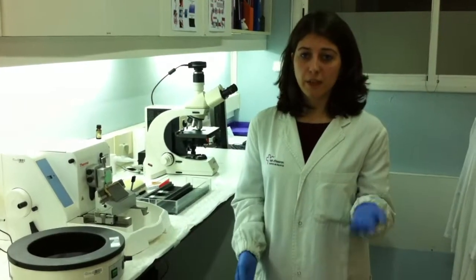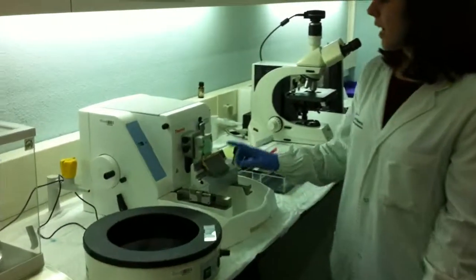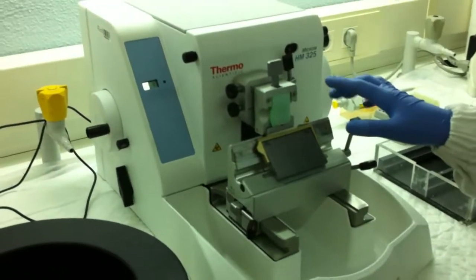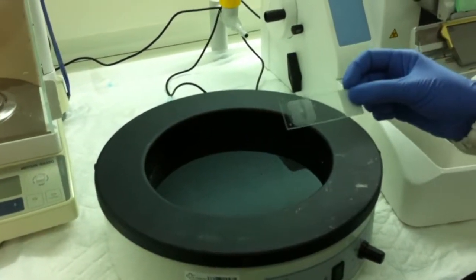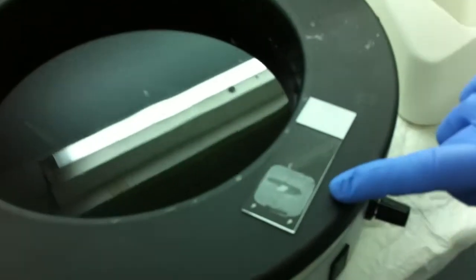To briefly illustrate what I've just explained: this is the microtome in which we cut the tissues, and this is the tissue included in a block of paraffin. We cut the tissues and introduce them in a water bath to make it easy to pick them up with a glass slide.